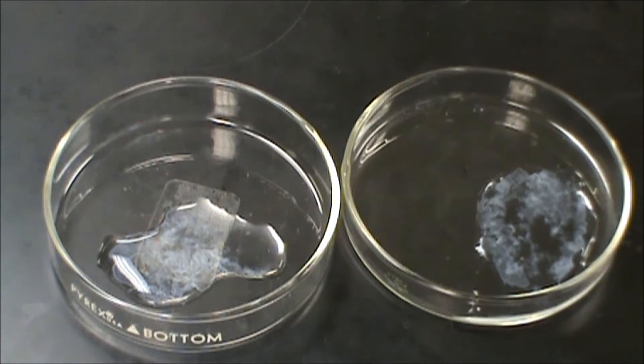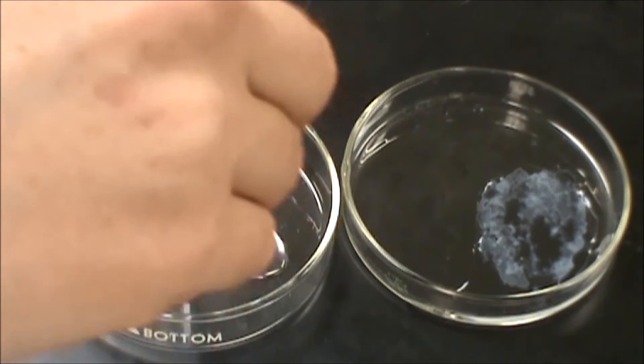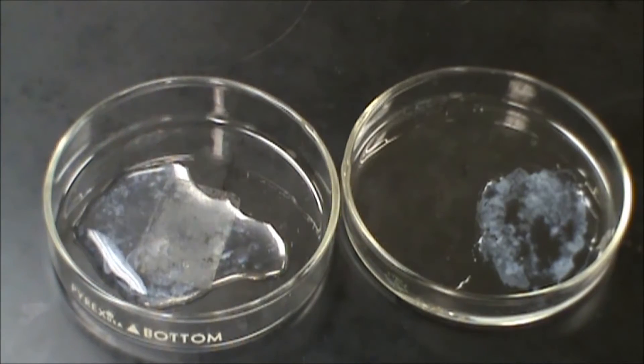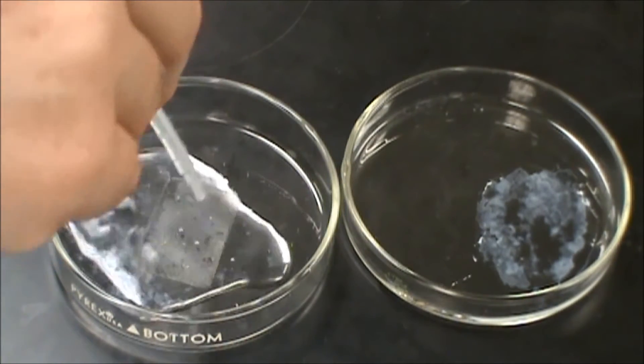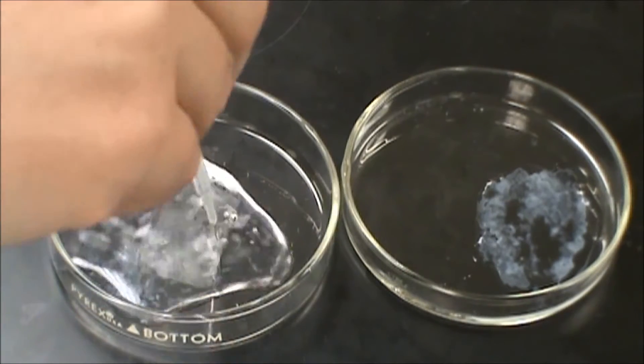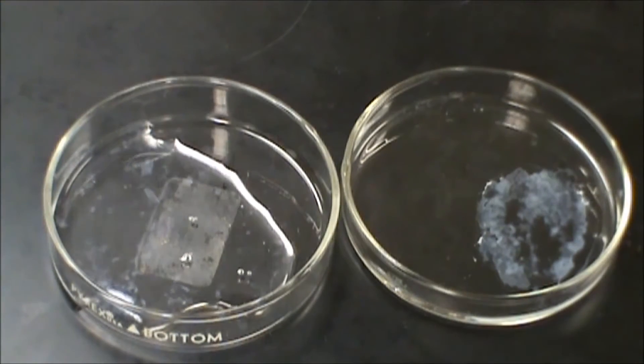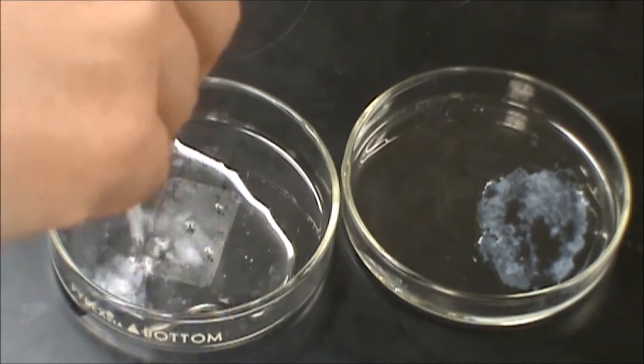Now the zinc hydroxide is what is amphoteric. So what I'm going to do here is take one of these and continue to add a lot of hydroxide to it. So I'm adding a base to it and the zinc hydroxide is going to react with that base to form something.